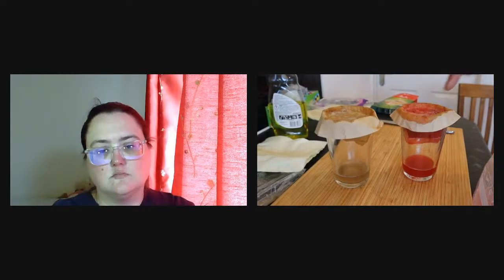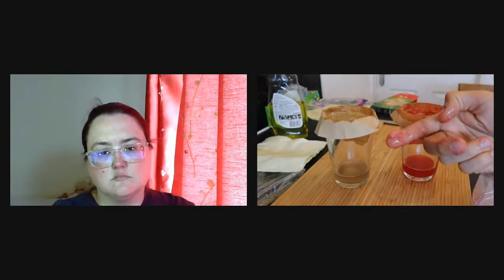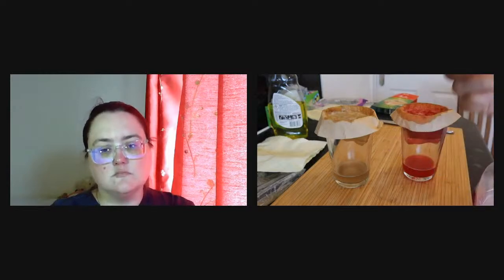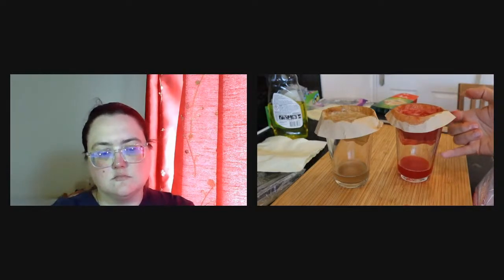We need to wait a little bit more, but you can see that I have removed quite a few big chunks thanks to the coffee filter. I will try to pick them up and show them on camera. So that's one of the big chunks that there is. And you can see at the very bottom in the glass, we don't have those big chunks anymore.